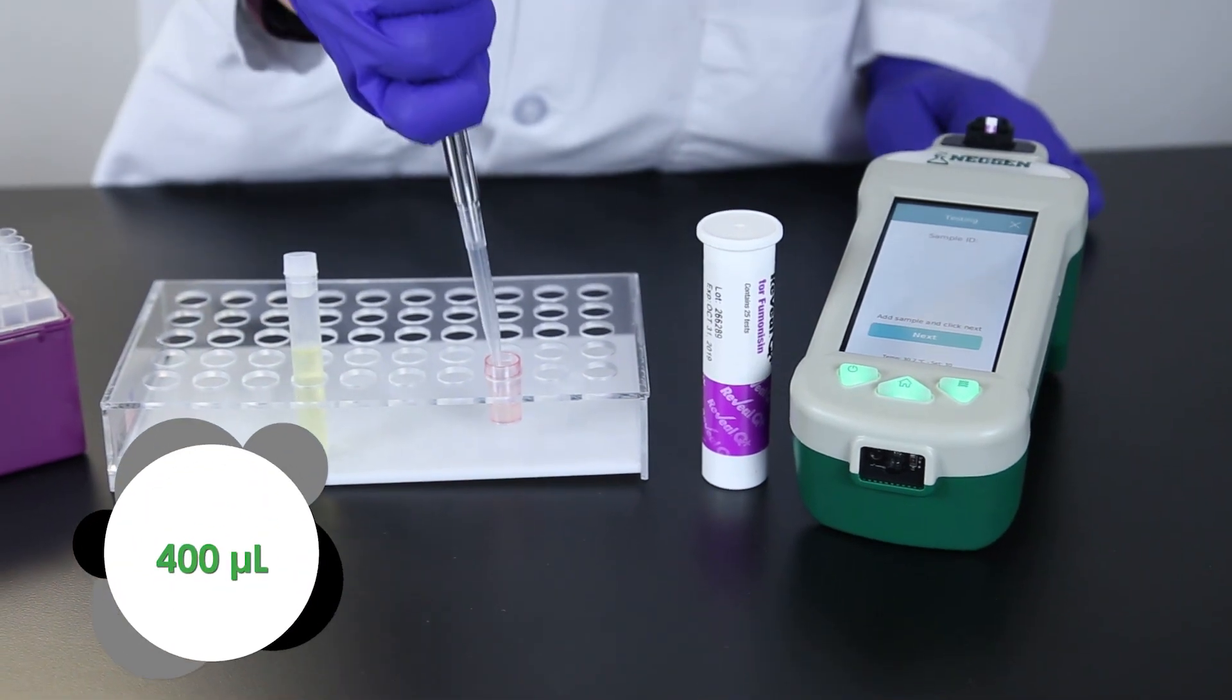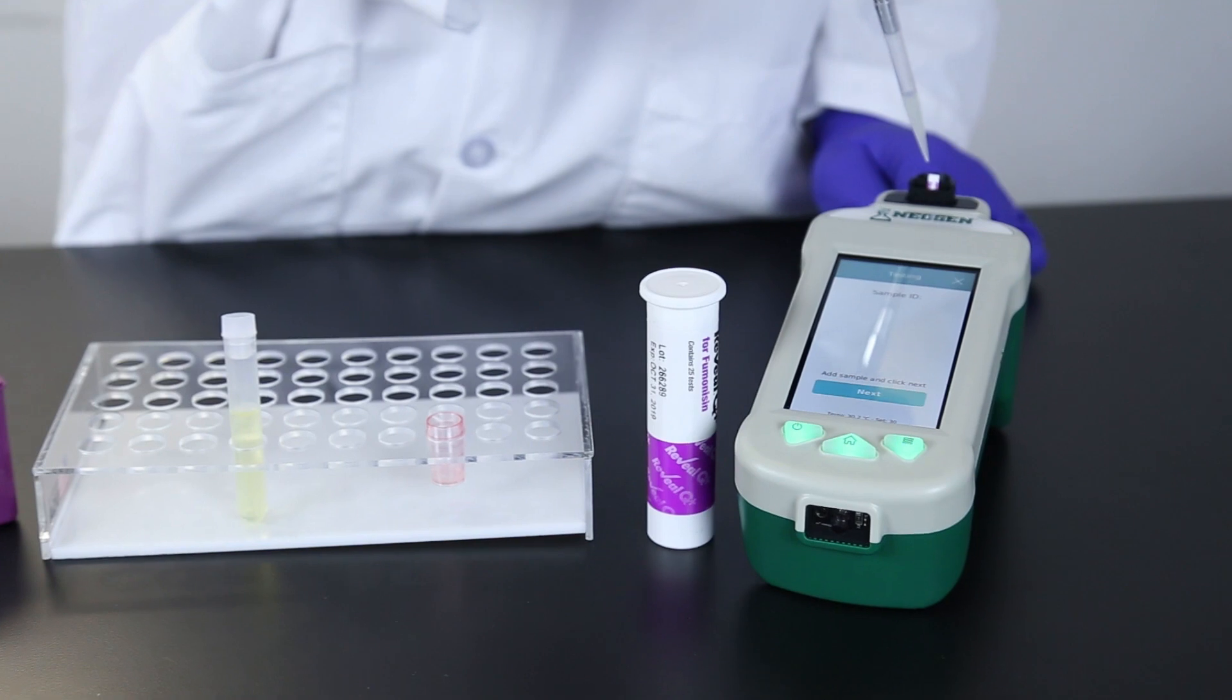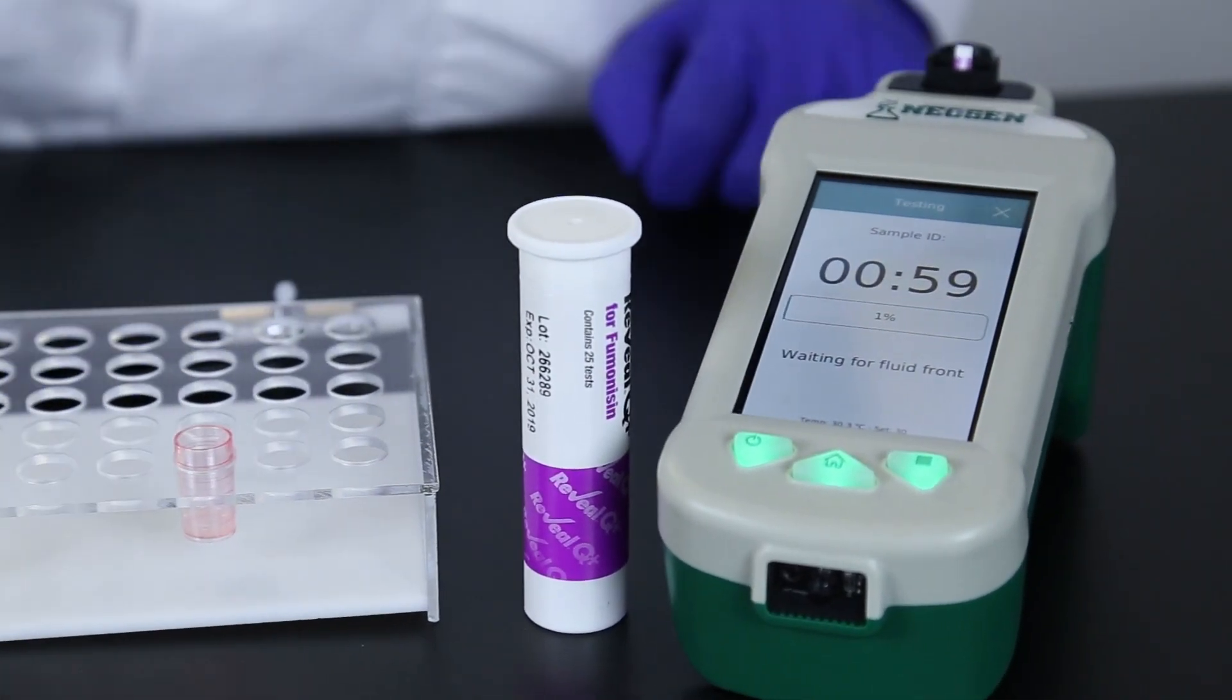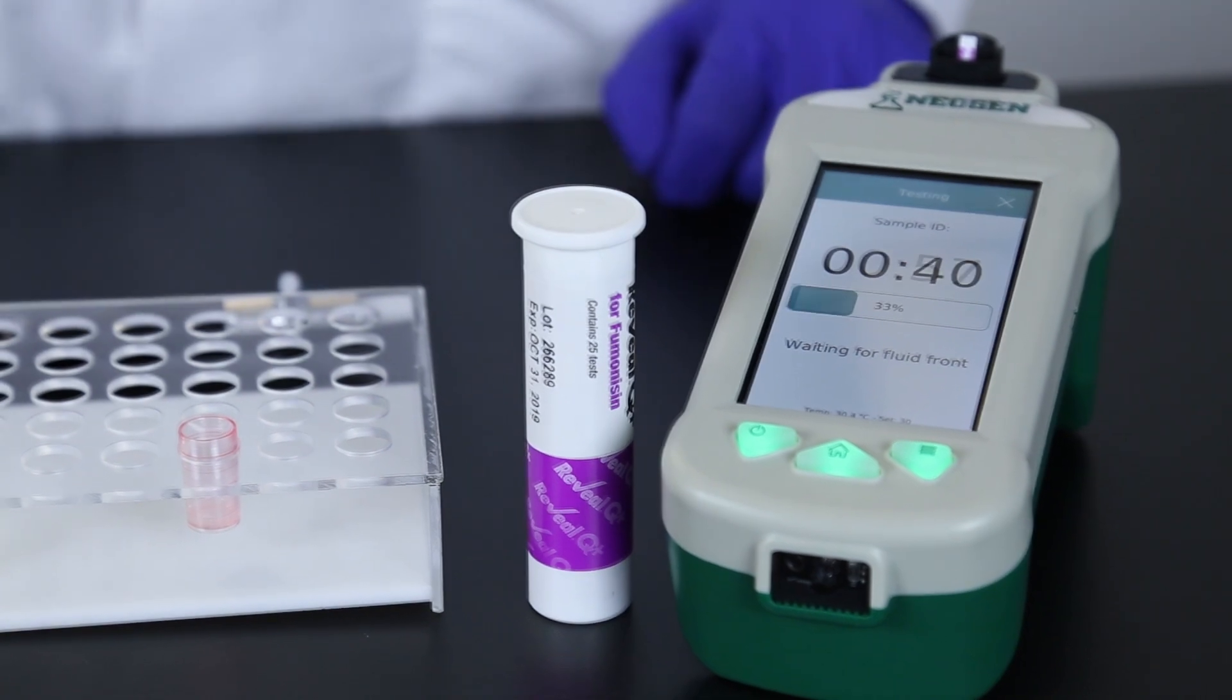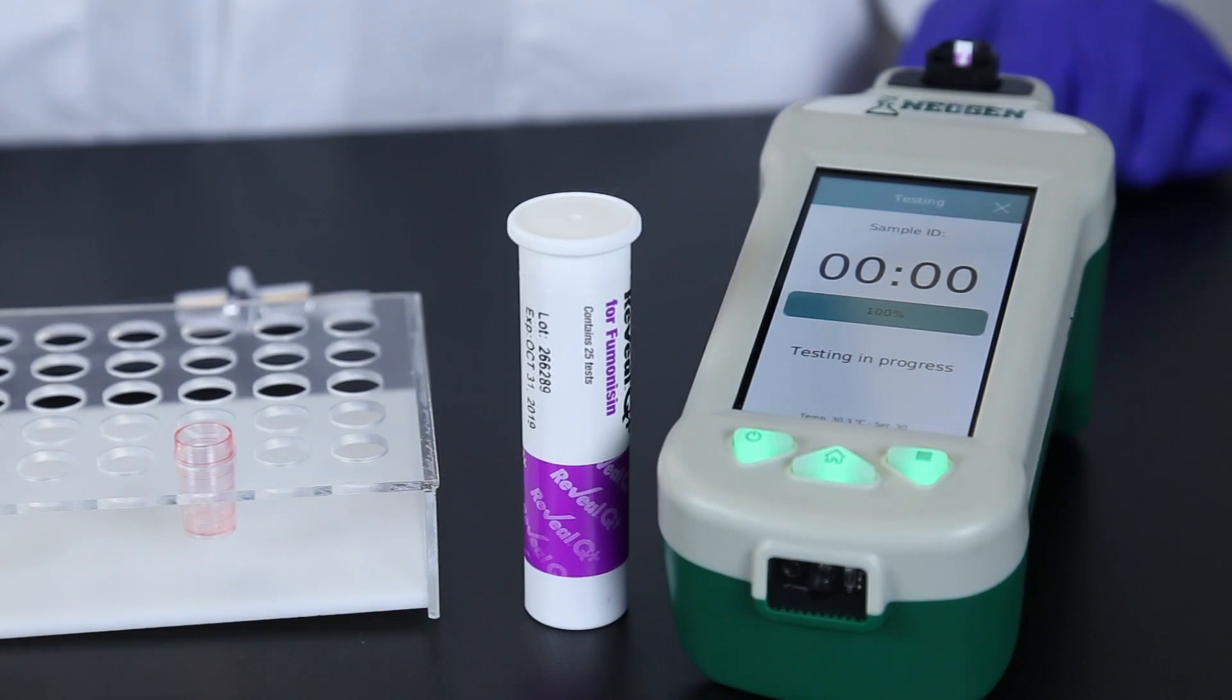Pipette 400 microliters of sample into the Raptor cartridge. The system and timer will start as soon as it detects the fluid front on the sample strip. After the six minute testing time, the Raptor displays your results.